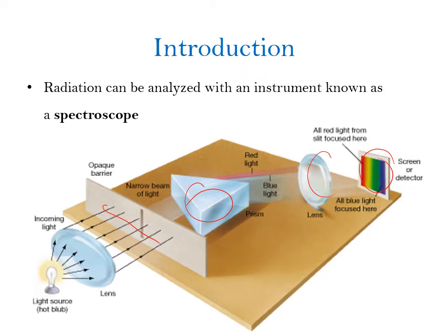A spectrometer is an instrument which is used to measure and record light waves over part of the electromagnetic spectrum or the line spectra, and it helps us determine the line spectrum of various light sources, materials, or elements. The spectrometer is also a tool used to examine which parts of light are absorbed by different materials. So spectroscopy is a process or a procedure, whereas a spectrometer is an instrument that helps to see objects through these spectroscopic techniques.